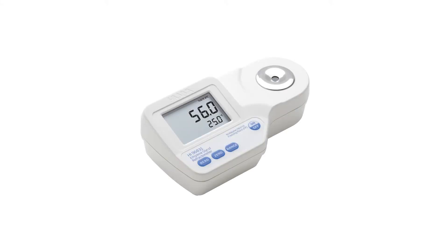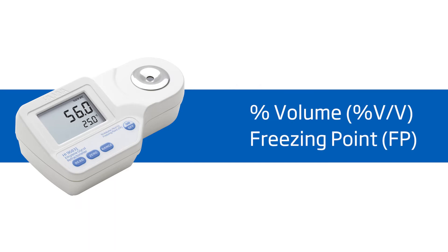Welcome to the HANA Lab. My name is Doug and today we'll be featuring the HANA HI96831 refractometer for ethylene glycol. This meter is ideal for anyone monitoring ethylene glycol content. It offers high performance and eliminates uncertainty involved with mechanical refractometers, all at around $175.